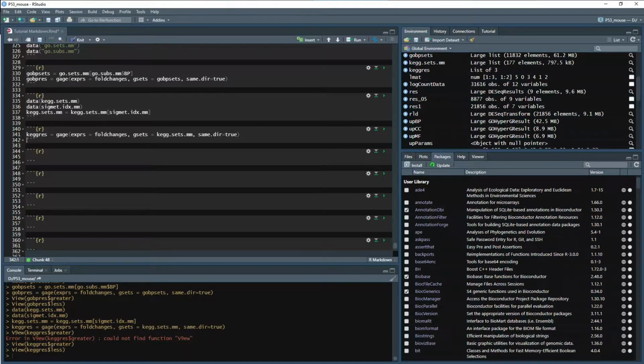But now that that is done, we can pull up the actual pathways and start plotting them, and then we'll get some really cool pictures. And to do this, we won't need to, but we'll use some tidy piping, and we'll select just the top handful of genes and then produce some plots there too. So to do this, we'll do KEGG res pathways equals data.frame.